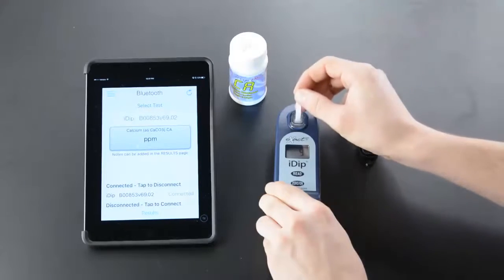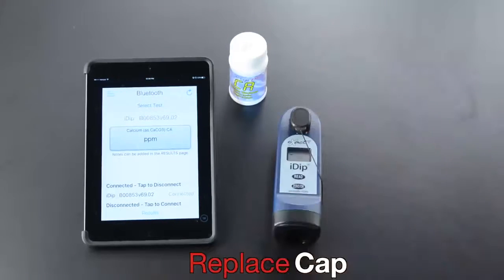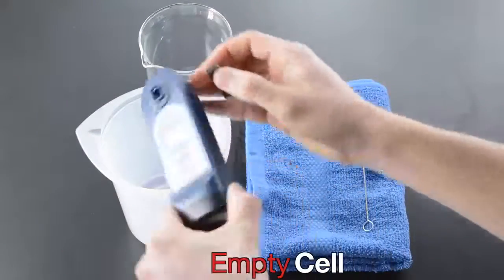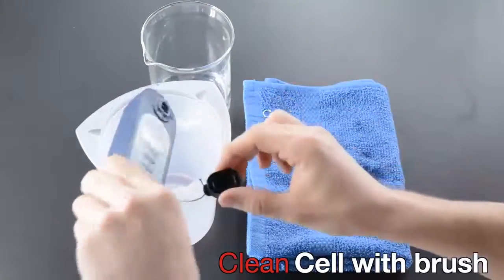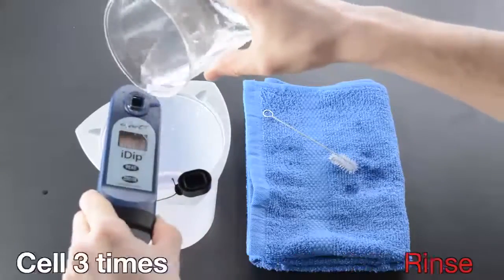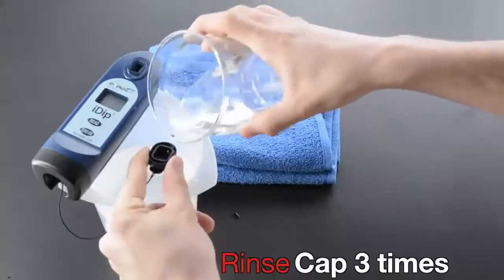Remove the strip at one second, replace the cap, and read the result. Empty the cell, clean the cell with a brush, rinse the cell three times, and rinse the cap three times.